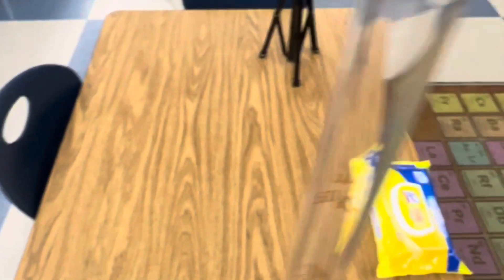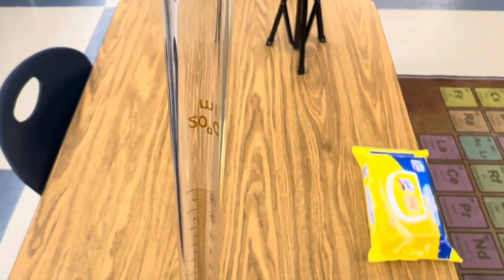Begin by first adding your sodium to your test tube. I'm going to take this small piece and add it to my test tube — all the way down. You can see it down there at the bottom.